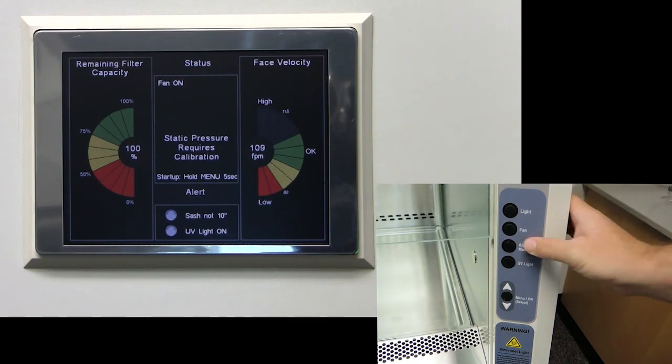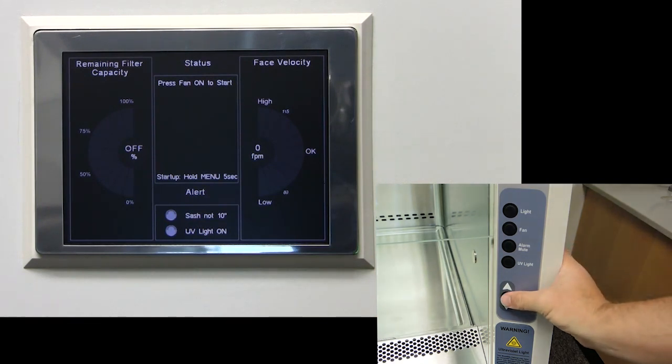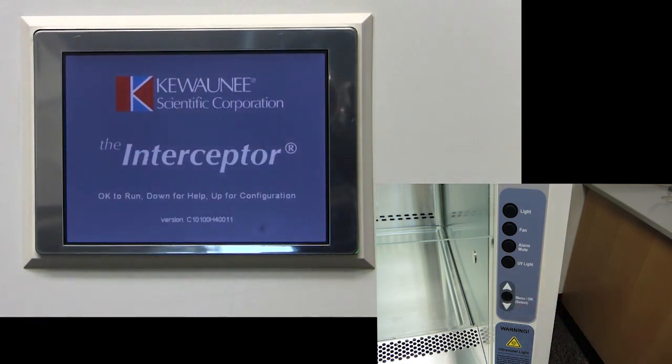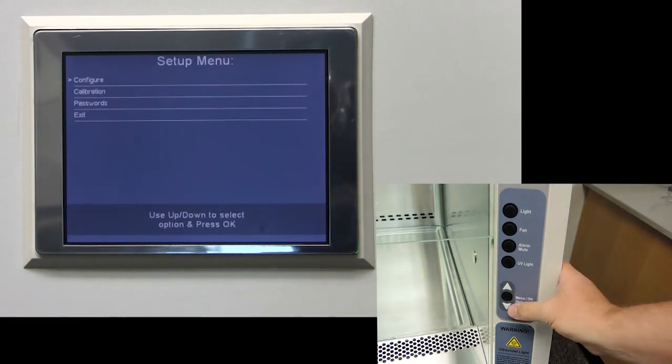Turn the fan off and return to the blue startup screen by holding the menu slash OK button for 5 seconds. Next, press up for configuration, and then select calibration.